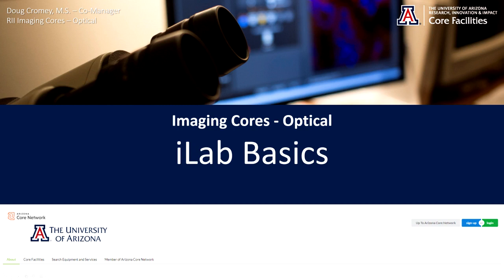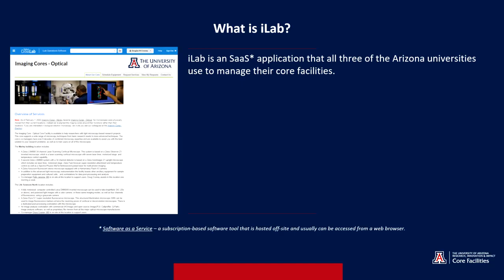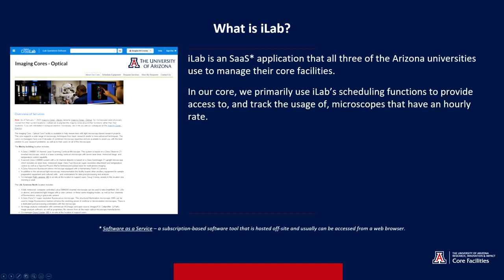Hello, I'd like to cover some basics about how we use iLab in the Imaging Core's Optical. iLab is a software as a service application that all three of the state universities in Arizona use to manage their core facilities. In our core, we primarily use iLab's scheduling functions to provide access to the microscopes or image analysis workstations and to track the usage.